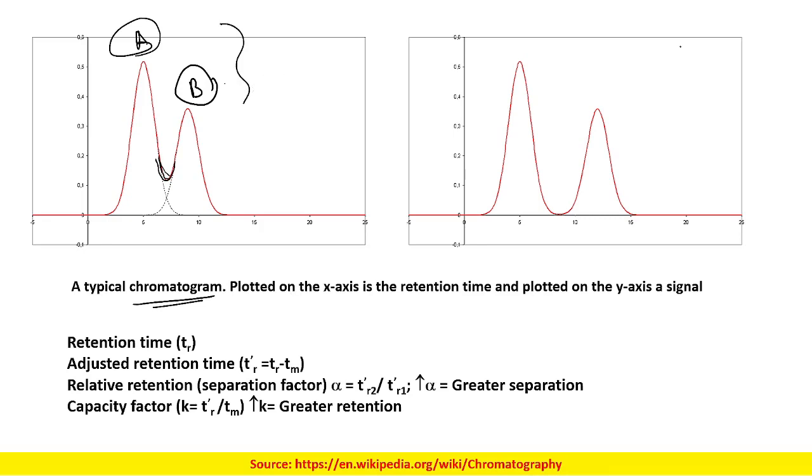That means it is not a proper elution. However, in the second case, after the complete elution of the analyte, the second peak has started. Here we will say that the chromatogram is a proper chromatogram, or proper separation of the analytes has taken place over here.